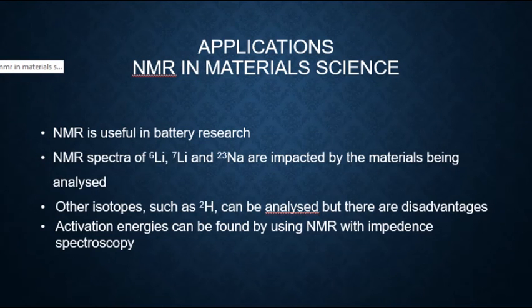Similar to other analytical techniques, NMR has been applied to various disciplines of scientific research. Such areas are material science and structural biology. Solid-state NMR can be useful in battery research. The goal of NMR analysis is to gather information associated with chemical shifts and spin lattice relaxation times to obtain information about phase chemistry, local structure, and ion dynamics.